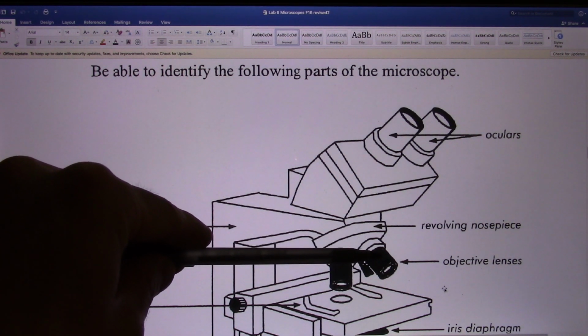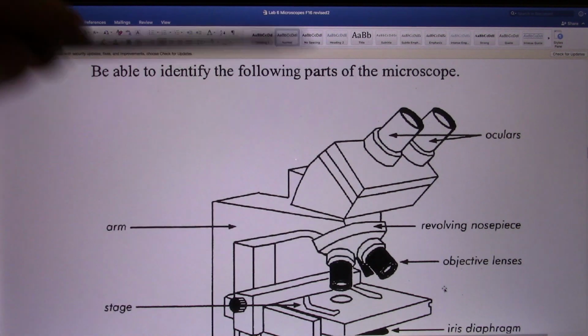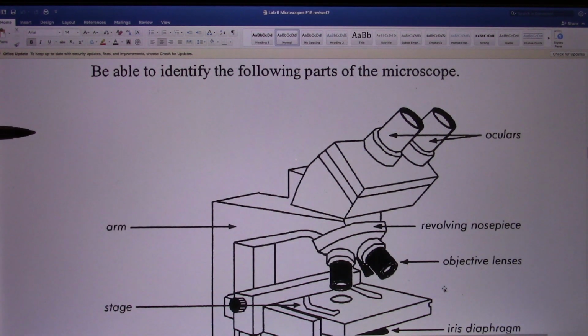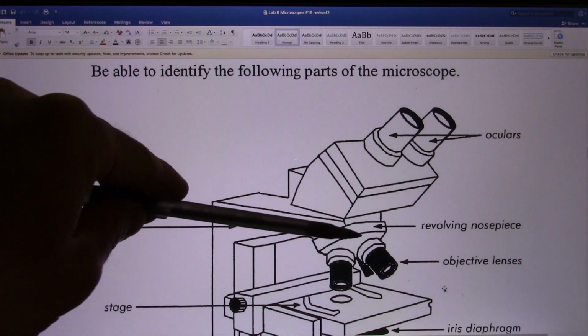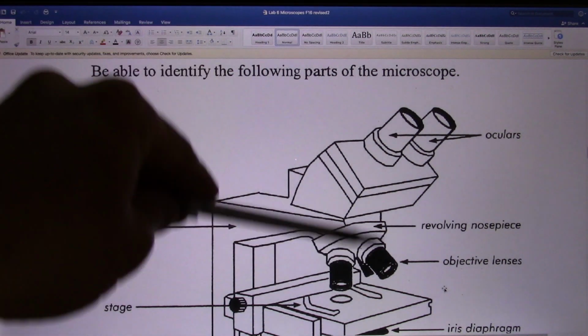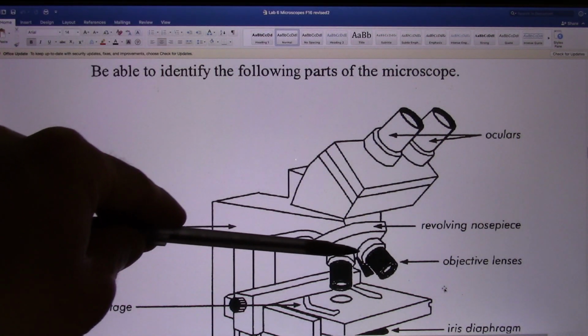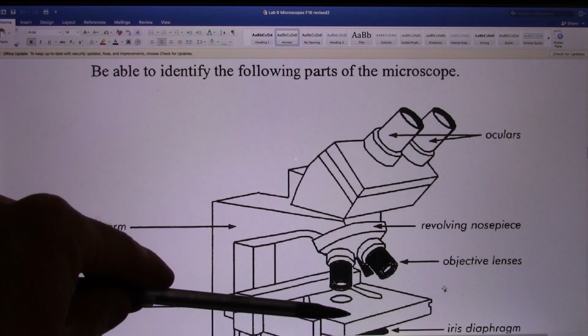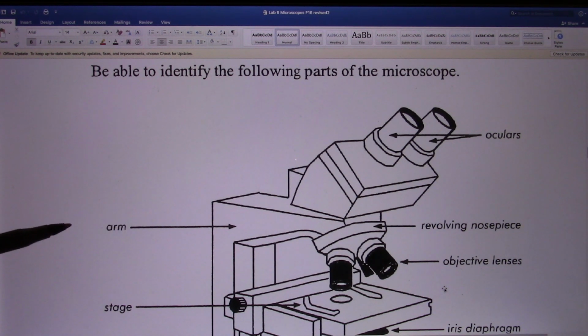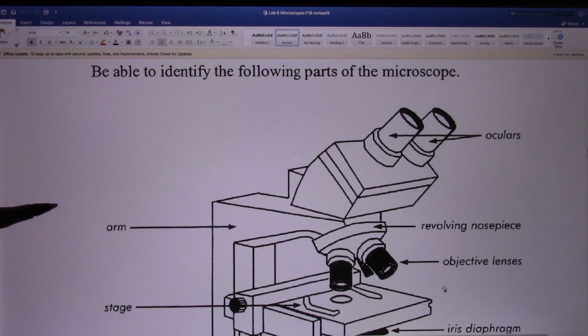And if I give you the 10x ocular, in the lab all the ocular lenses are actually 10x, and a 10x objective, the total magnification would be 10 multiplied by 10, that's 100. And if I give you the 10x ocular lens and 40x objective, it turns out the total magnification would be 10 multiplied by 40, that's 400. So that's how we calculate the total magnification. This microscope can amplify the signal 100 times, sometimes thousands, depending on how you use these two lenses. And the bigger the objective, the bigger the magnification, but your sample will be closer to the objective lens. That's why you need to use the fine adjustment knob when you are in the high magnification. Okay, that's pretty much it.